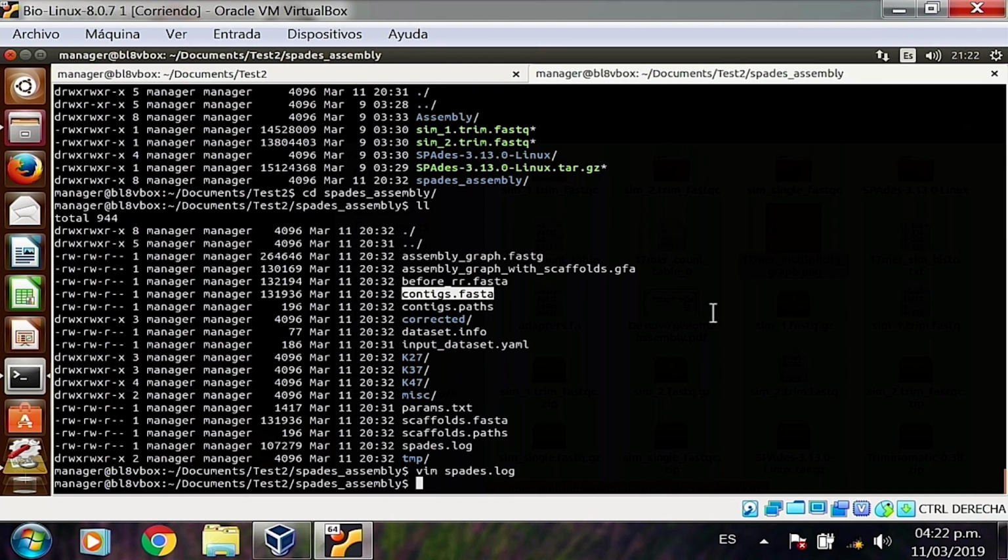From this point on, if you remember and if you're familiar with the FASTA format, you should know what to expect. A FASTA format is just another way of showing sequences. This is not a FASTQ format like the one you get from sequencing machines, where you have one line for sequences and another line for qualities. No, this is a FASTA format, which means that you only have sequences stored here. There is no quality associated with them.